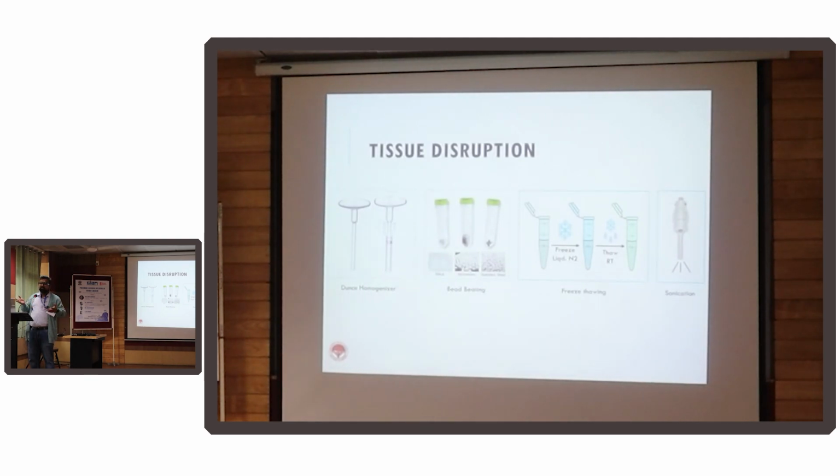And it will impact everything. And no amount of AI/ML can save you from a careless researcher who has not done his baseline correctly. So always remember, when you are at the wet lab, be extremely vigilant. If you are using 10 strokes, for the next 3 or 4 years, you have to use 10 strokes.